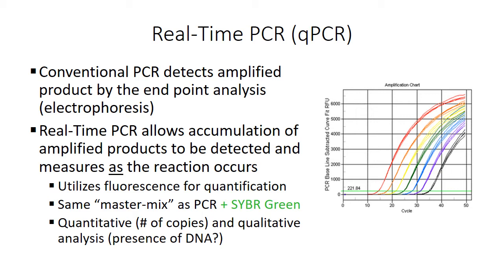Now, your traditional master mix, just as a quick review, is where you have your DNA polymerase, your enzyme needed for DNA replication, where you will have your nucleotides, where you will have your primer, and also where you will have your buffers and your coenzyme. Remember that you still have all the material posted on D2L, so if you want to review your PCR, by all means do so.